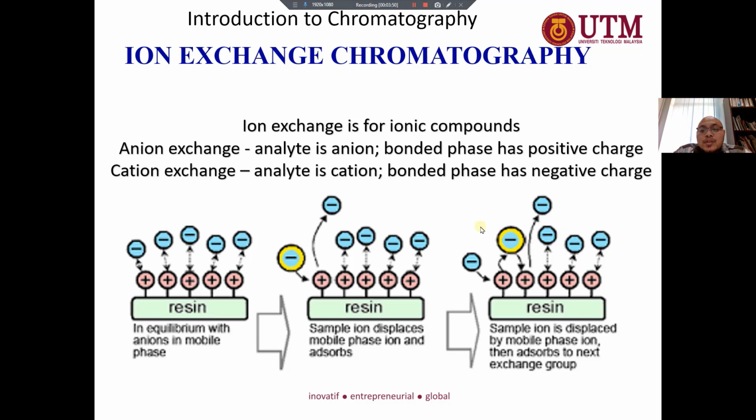So basically, anion exchange is for anion analytes. Cation exchange is for cation analytes. The bonded phase has the opposite charge of the analyte of interest to make the separation better.